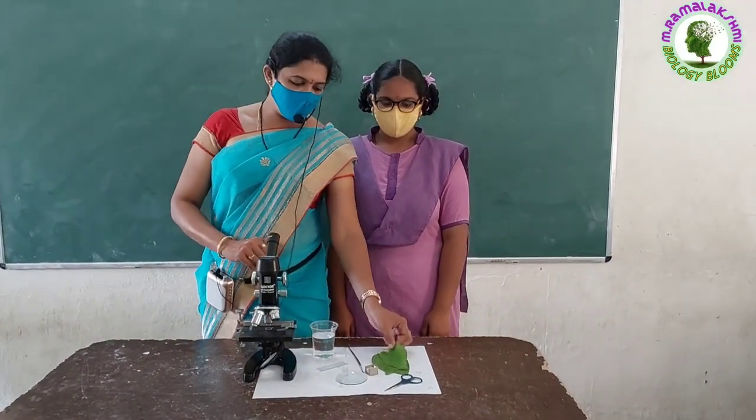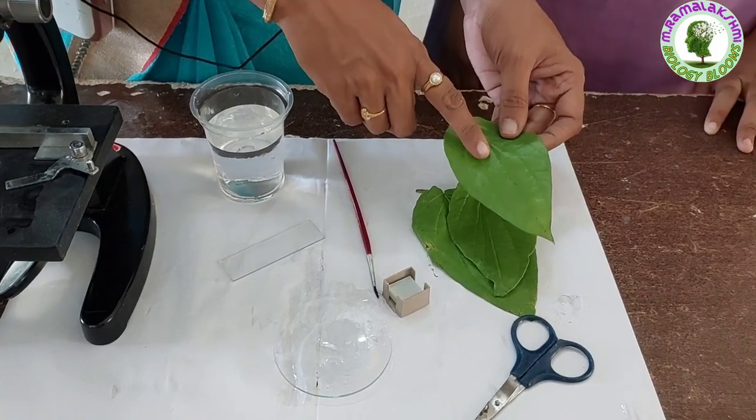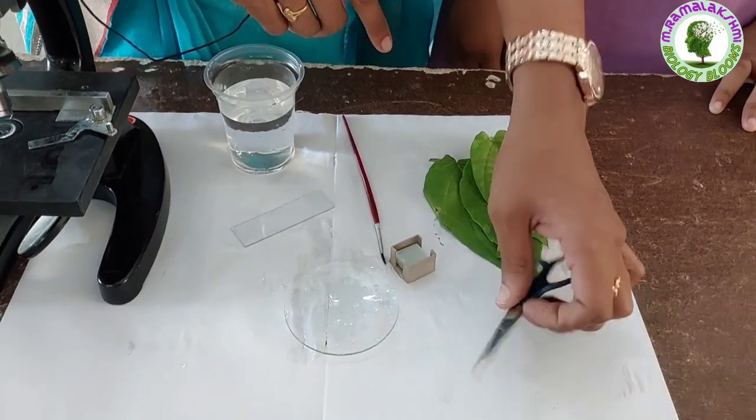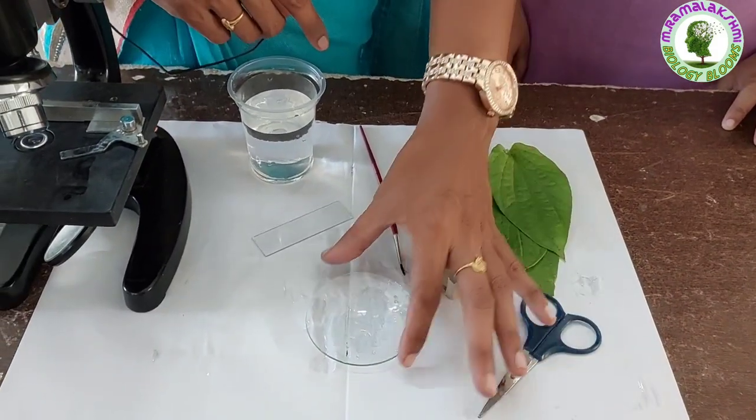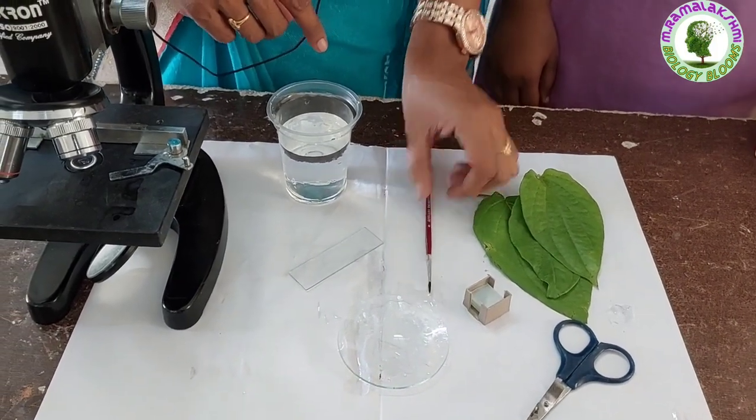Children, today we will observe the stomata in a betel leaf. For this we require betel leaves, scissors, cover slip, watch glass, slide, brush, and water.